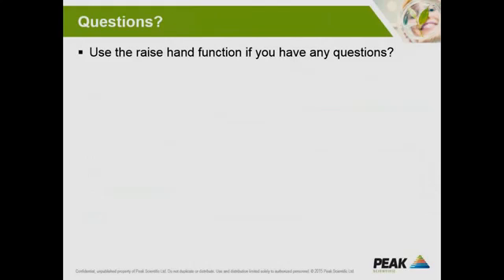No? Okay, so the questions are, how do you calibrate or qualify the gas generator? And how do you test the generated gas? Okay, so all of our systems have been developed here at Peak Scientific in Glasgow by our engineering R&D team, and so the purity of the hydrogen is determined through measurement of moisture and other contaminants within the gas.